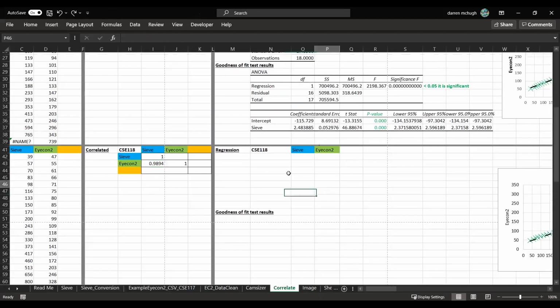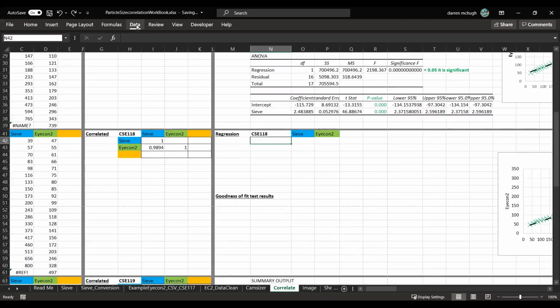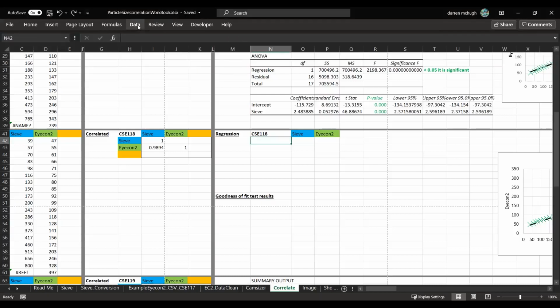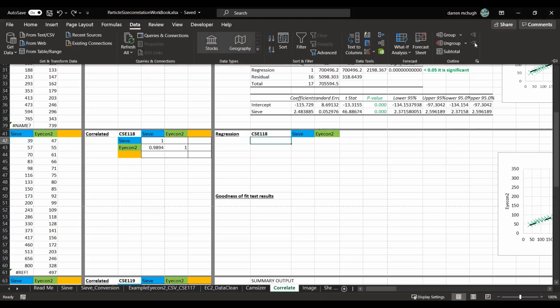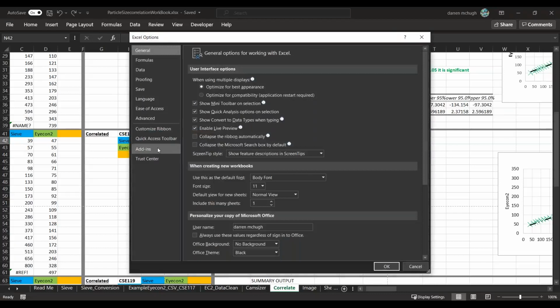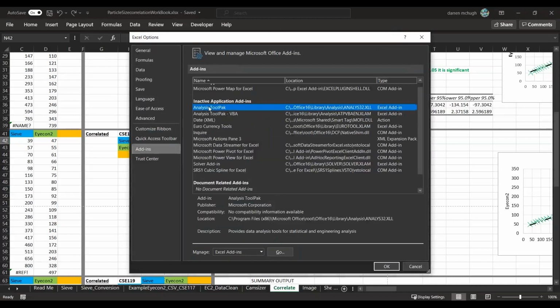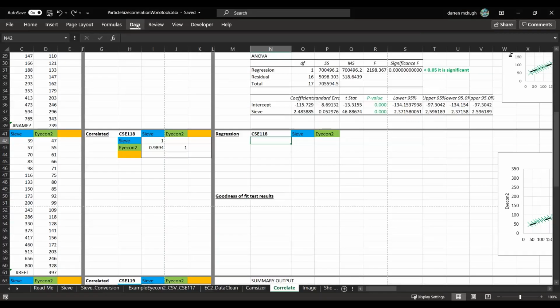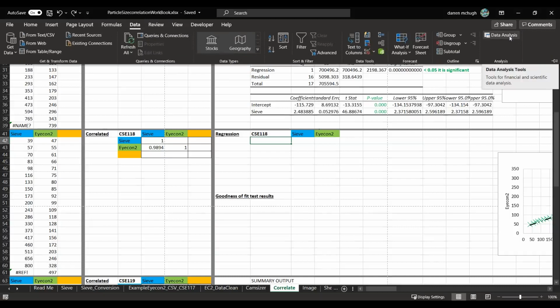And I'll just show how you do that with Excel. I'll click this here. So this is actually a plugin that's probably not activated by default by Excel. You actually have to go and install this. So sorry, bear with me. Oh, it seems to have been even deactivated for me. Okay, this might be a good example to show how you actually activate it. So we can go to options here, or add-ins, Analysis ToolPak, make sure that's activated. And then you actually get this little bar added here under your data tab.